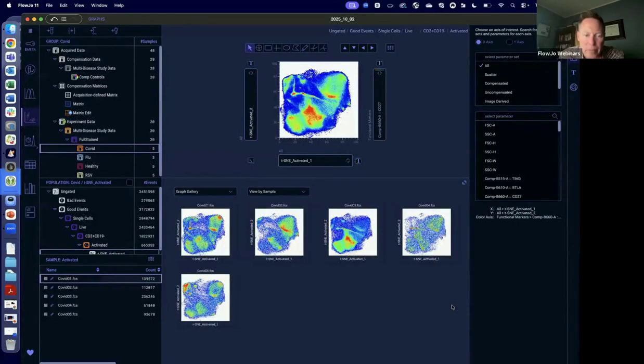There we go. Okay. And so I also set it to a relatively small downsample of 100,000 events out of whatever that was running on, almost 700,000. So a little bit of a funky t-SNE when you re-upsample 85% of the data. But I think it shows us the major highlights of the data, which we could look through with heat maps and so forth. But we've got 5 minutes left, so let's talk about some other parts of the program.